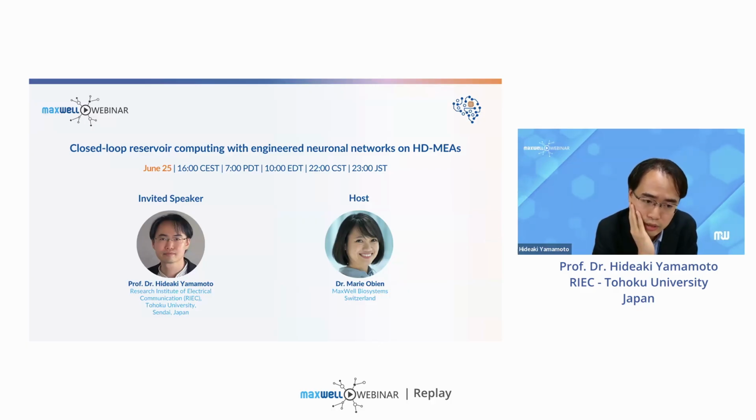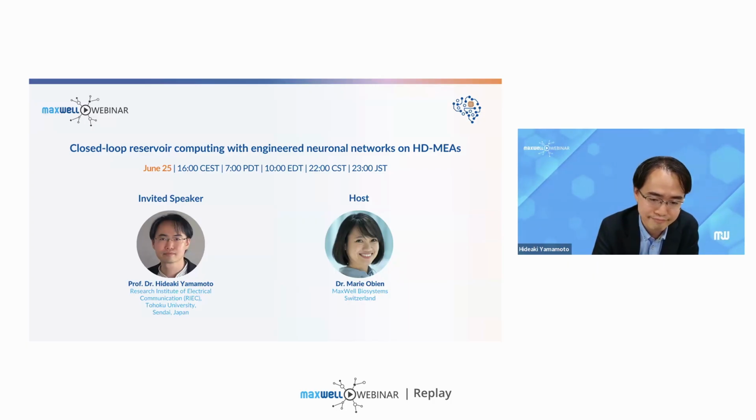And so the second half of the question was, could there be an effect of network size on the dimensionality of the dynamics? There could be, but what we can interpret is that since there are a greater number of neurons in the homogeneous case, the reduced dimensionality in the homogeneous case is not attributed to the effect of reduced number.